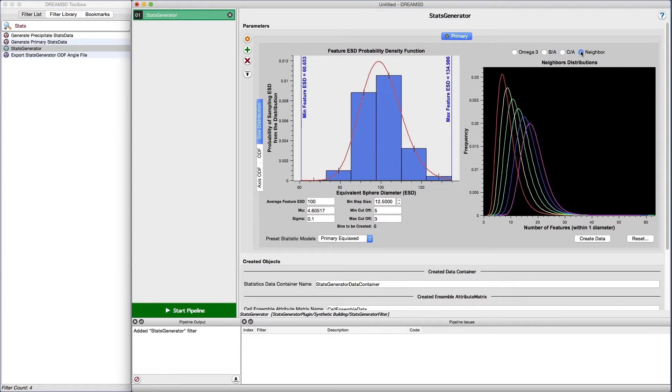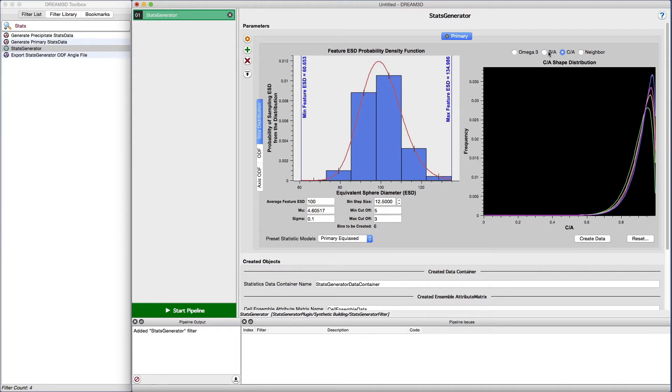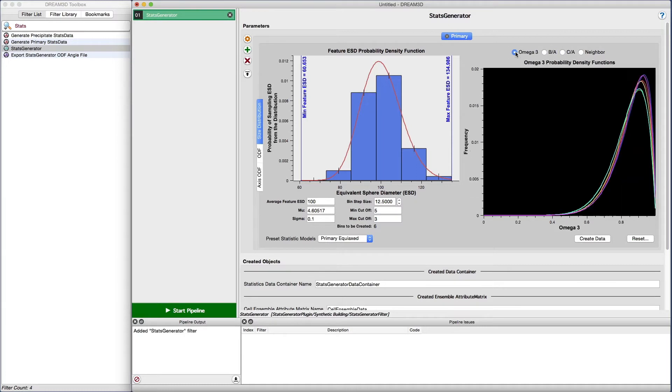The neighbor distributions tab shows the distributions that will be used to calculate the number of neighbors that a grain has. The default values for each distribution are known to generate a reasonable microstructure, and therefore we're not going to adjust any of those values today.